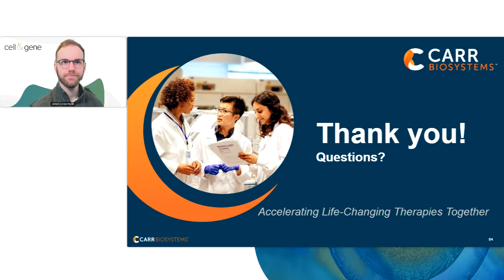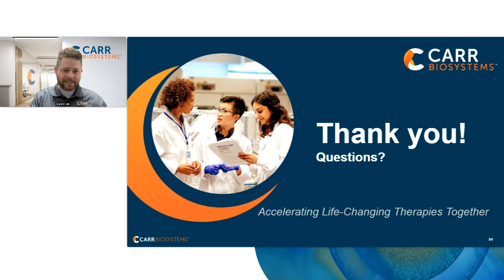Yeah, that's a great question. Since I just mentioned perfusion, not something we talked about here necessarily, but when you're talking about perfusion, which is really just a prolonged media exchange, you're just bringing the medium out and bringing the cells back in, retaining those cells. These types of centrifuges can be used for that. We have seen that use case from some of our end users today, where you can bring the cells out, discharge a large portion of the spent medium, for example, and then bring the cells back into the reactor. I'm not sure I'm answering all of the elements there, but let me just see if I can look.